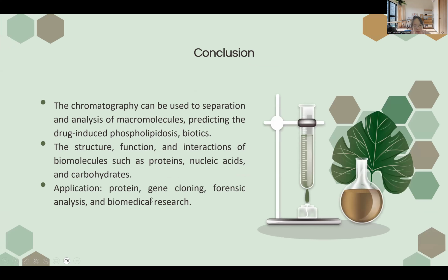In conclusion, many types of chromatography, like high-performance liquid chromatography, countercurrent chromatography, and gas chromatography, are employed in biological research, which can be used for separation and analysis of macromolecules and predicting drug-induced phospholipidosis.